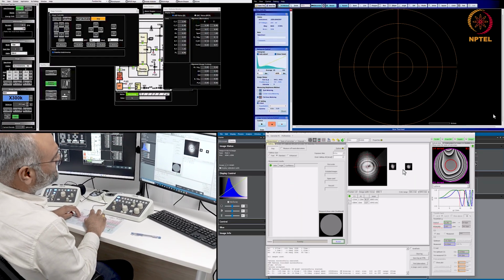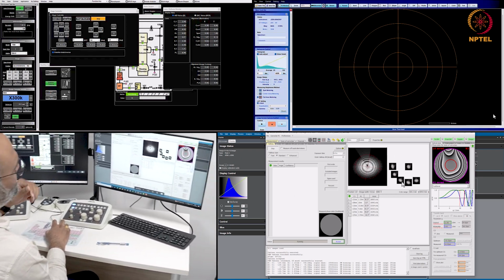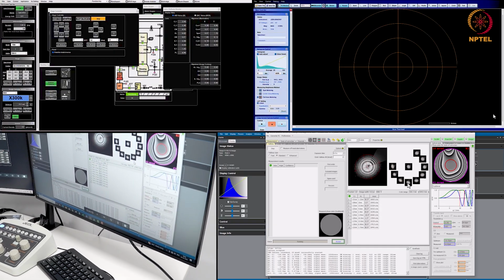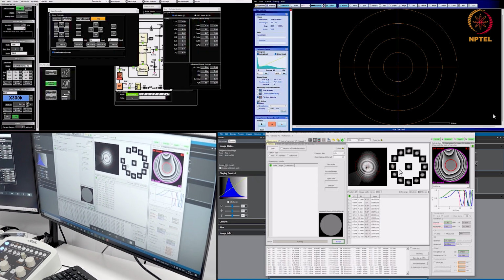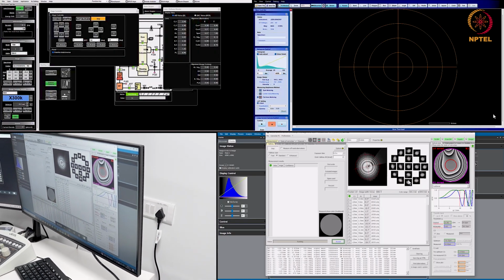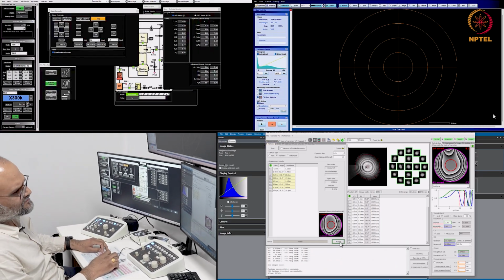When I do it in fast mode, it only got 8 acquisitions at 8 different tilts, but here in standard mode it does more. There are about 12 such different orientations now. And you get 4 more inside. So let me accept this.